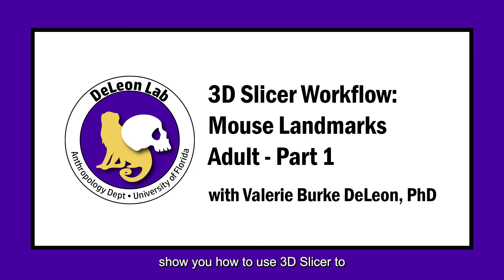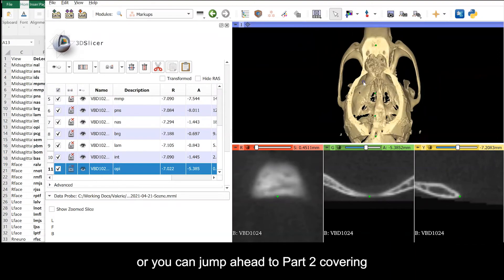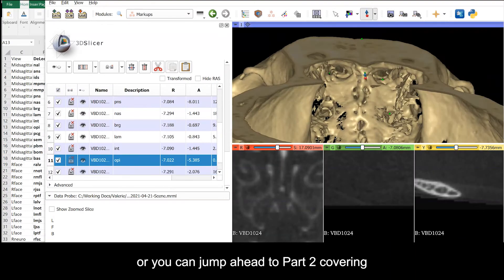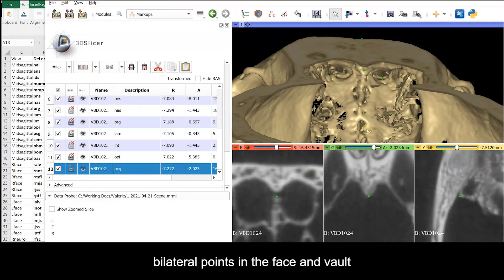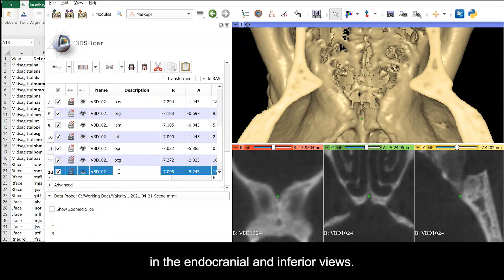This is Valerie DeLeon, here to show you how to use 3D Slicer to collect landmark coordinate data from reconstructions of the adult mouse skull. In part one, we'll cover mid-sagittal landmarks, or you can jump ahead to part two, covering bilateral points in the face and vault, or part three, covering bilateral points in the endocranial and inferior views.